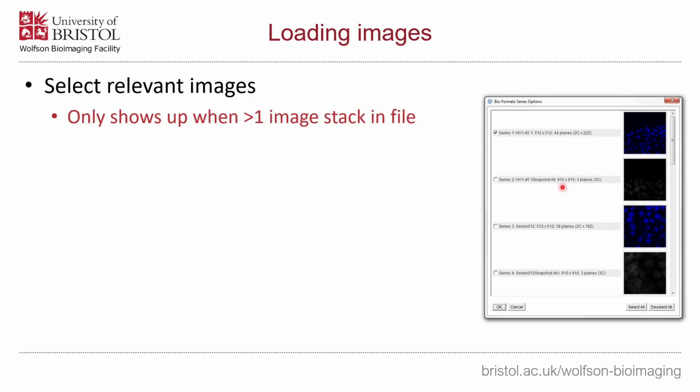If you've got more than one image series within your proprietary format that you're loading with Bio-Formats, you'll be presented with this window, where you can scroll through all the different series and then just put ticks against the ones that you want to load in.